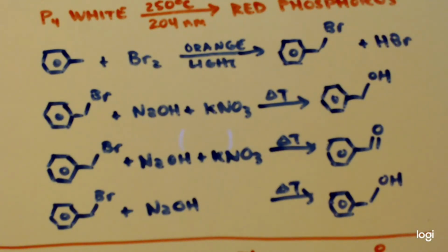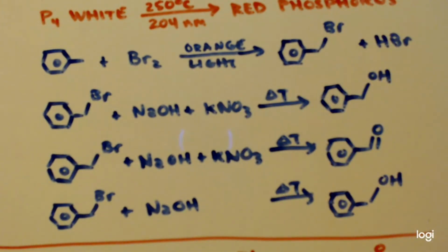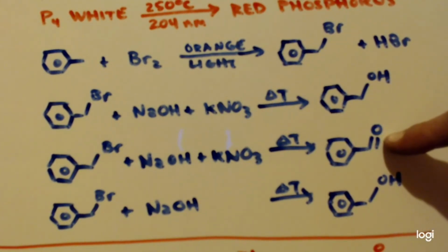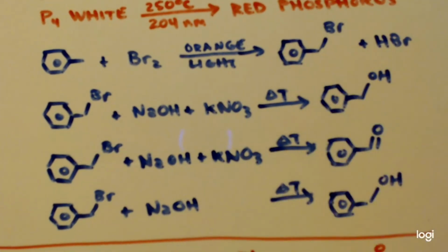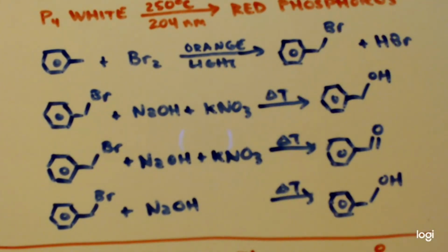And I'm going to do three reactions with benzyl bromide. I'm going to do one to make benzyl alcohol using the potassium nitrate. I'm going to use the same basic thing, but kind of different heat and different ratios. So I'm going to make benzaldehyde. And I'm just going to use sodium hydroxide to make the benzyl alcohol, just like up here, but with no potassium nitrate. It takes forever. It's like a 30-hour thing. But I want to see, you got to try out every experiment.